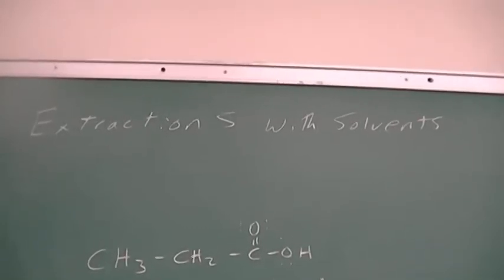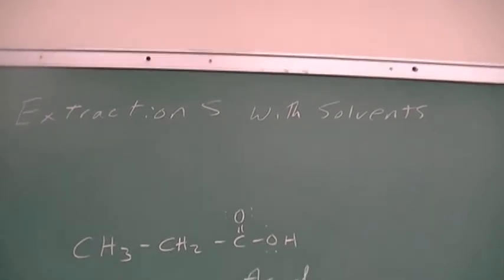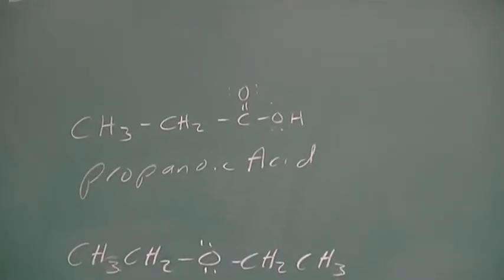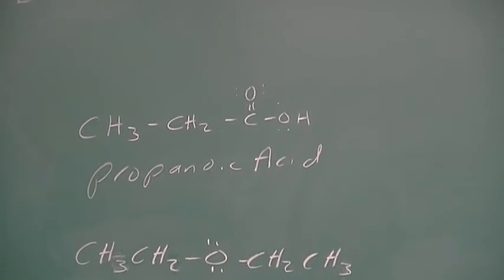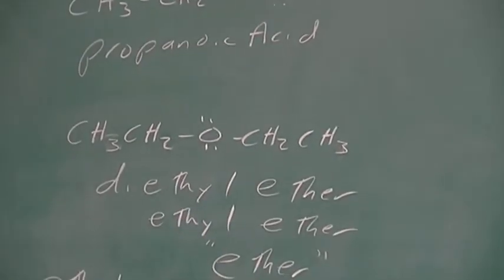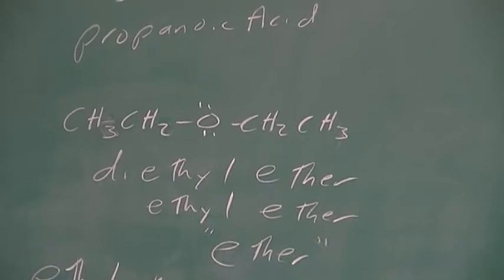Alright, the experiment we're going to do today is extractions with solvents. What we're going to have is a propanoic acid solution. So we're going to put propanoic acid in water. Then we're going to use diethyl ether or ethyl ether or simply ether.